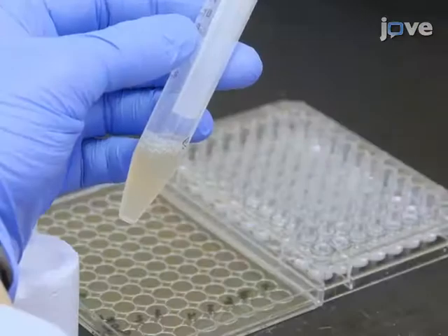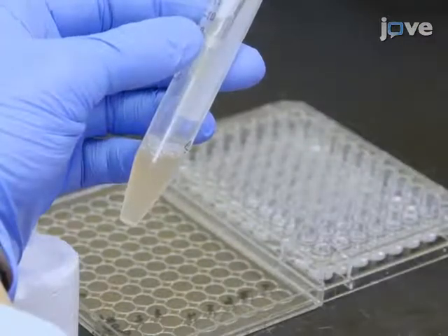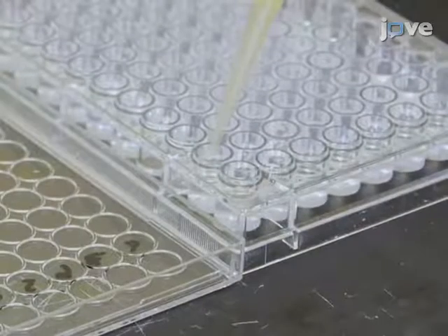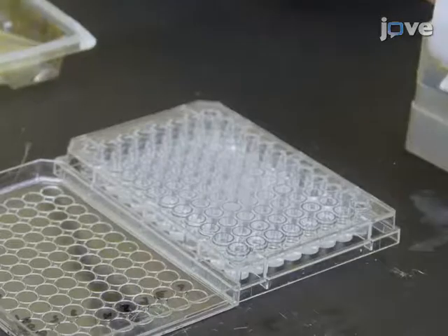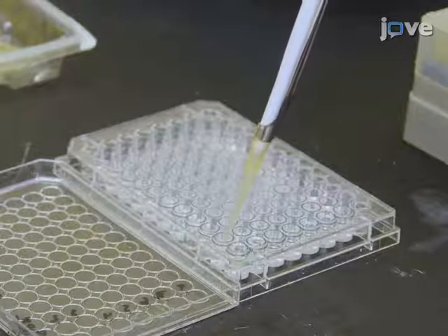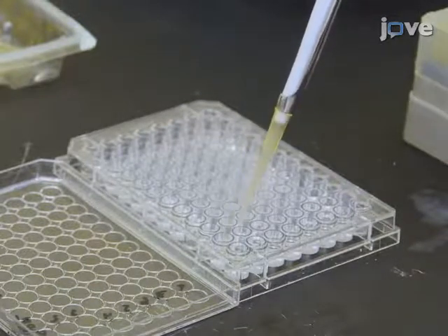To enumerate only live cells, make a serial dilution of each of the selected bacterial samples with sterile 0.9% saline solution by transferring 20 microliters of the bacterial solution to another well and diluting it with 180 microliters of saline. Repeat the procedure.